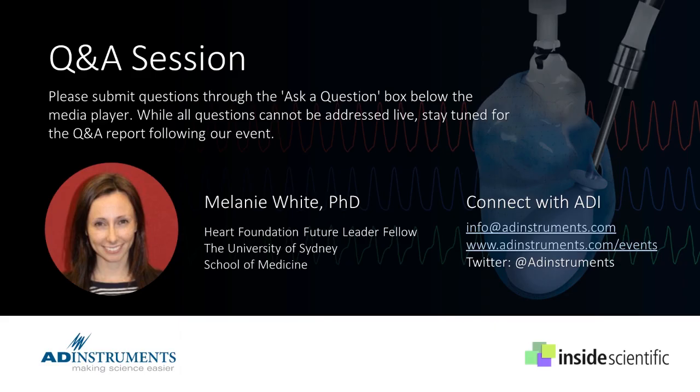between excision of the heart and hanging of the heart, which is essentially a small ischemic insult. And what the heart is actually doing is going into a level of contracture. So by putting the balloon in with a small diastolic end load, we're allowing the heart to relax around it. So for a small decline in diastolic pressure, it's totally accepted. And that's why, in the rat setting, we would normally set our diastolic pressure to between 10 and 15 millimeters of mercury during the baseline period.